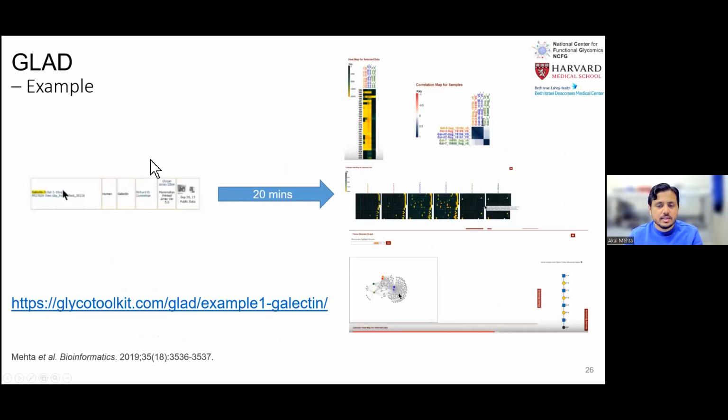I won't go into the details of this. There is a very in-depth documentation as well as a YouTube video on this. You can find that video as well as links to the documentation over here. And basically in this video, you can go from any of the CFG data sets in 20 minutes to generating graphs like this with a few data sets from the CFG data.